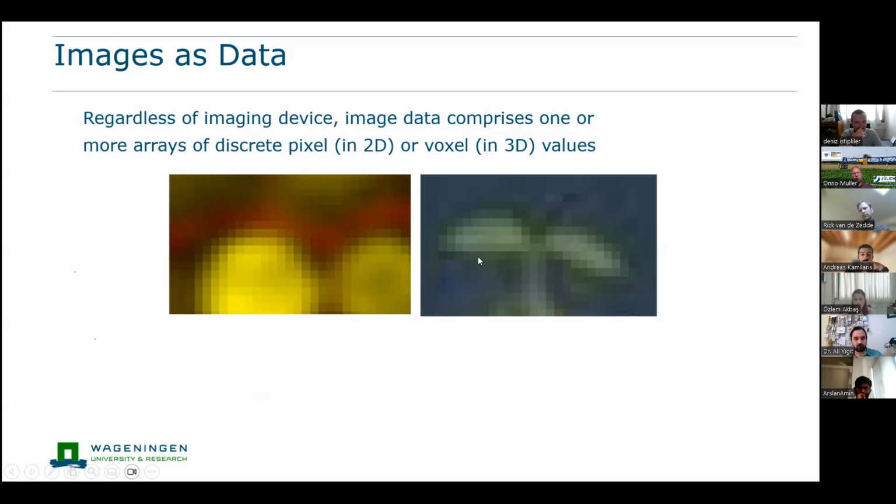So here, maybe this is a plant, right, with leaves, maybe this is a stem, but then the algorithm is diving into each individual pixel, and it needs to figure out if this pixel belongs to the background or to the plant. And you can see actually that it's quite fuzzy.